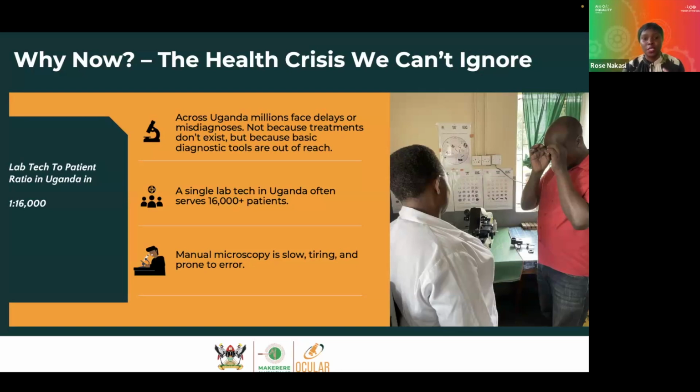And that's why, according to the WHO standards, experts are required not to screen more than 30 patients in a day. But what that leaves, especially in highly disease endemic settings, is that most of the patients are either not going to have gold standard diagnostics, or they have to wait longer until they get this kind of diagnosis.